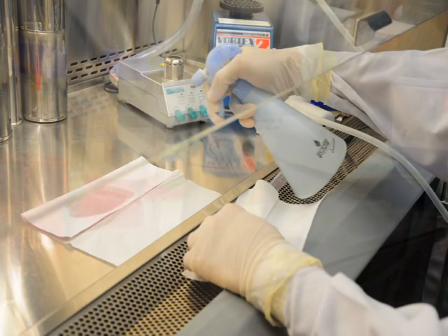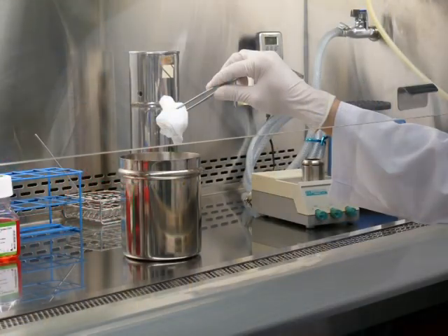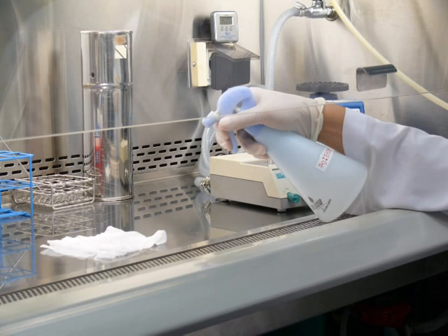Allow the solution to contact the spill for at least 15 minutes. Longer if spore-forming organisms are involved. If there is any broken glass, pick it up with forceps and place it in a sharps container. Next, gently pick up the paper towels with tongs and place the paper towels in a waste bag for further decontamination. The spill area should then be cleaned again using the decontamination agent. Contaminated gloves should be disposed of properly.